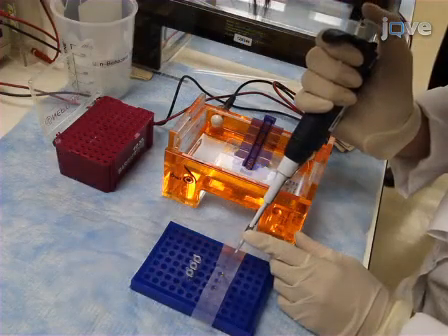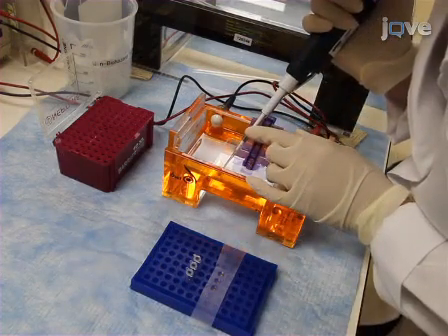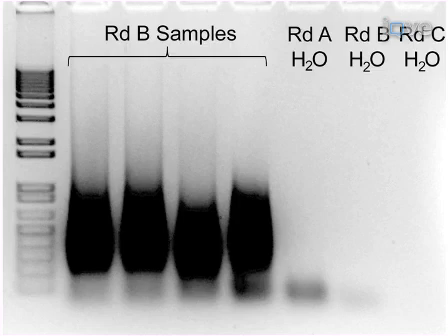After PCR, check the PCR product on a 1.5% agarose electrophoresis gel. A smear from approximately 200 to 1000 base pairs should be visualized.